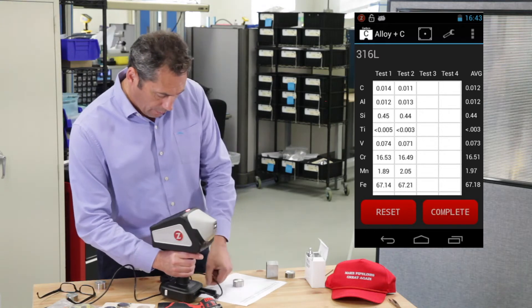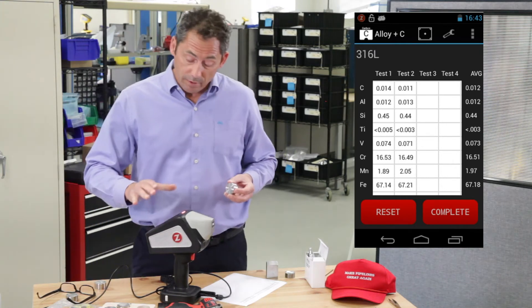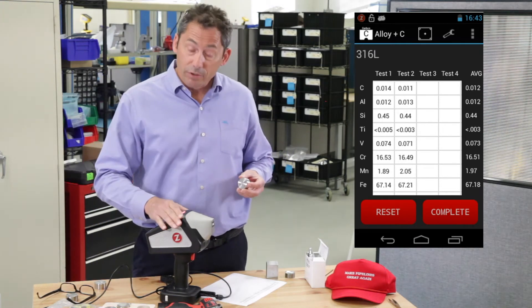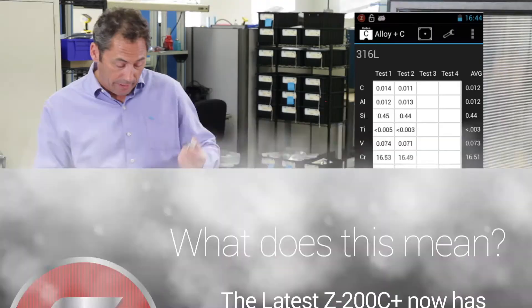Okay, so this is what I want to make a point about with some of the updates to the analyzer. Carbon signal's higher, precision is better. This is an 316 L-grade.